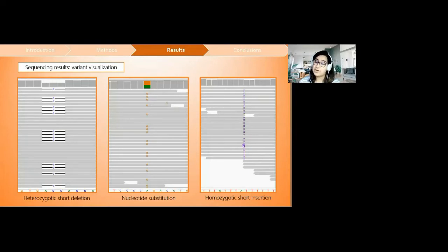High coverage variants are ideal for this, often correctly prioritized by the software and can be visualized in intermediate files, as shown here. But due to knowledge limits and technical limitations, the results did not show the correct causal variant in 14 cases.